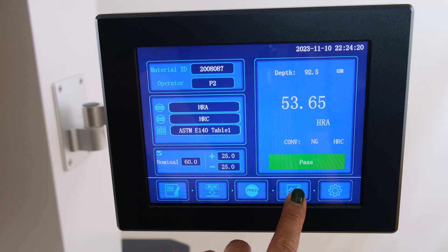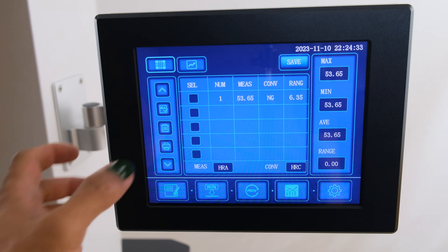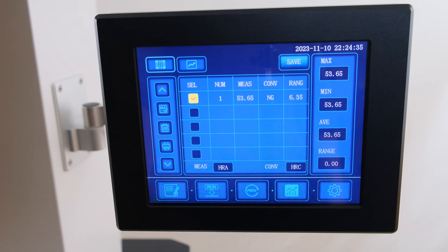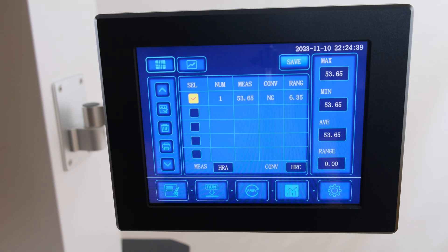The fourth icon will open the machine's data storage menu. In this menu, the results from the prior tests will be shown along with their respective controls. Individual data points can be selected and added to a batch manually for sorting. Otherwise, the machine will do so automatically based on the maximum test number size under settings.